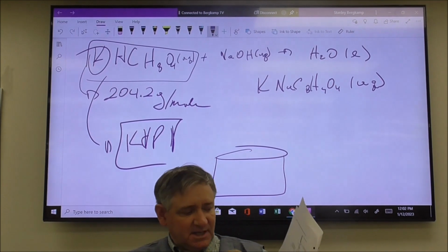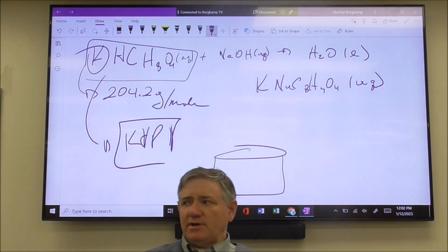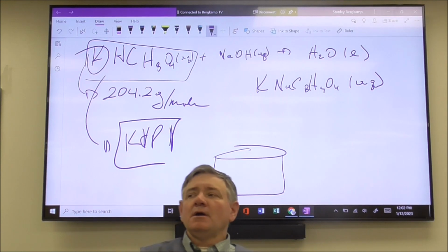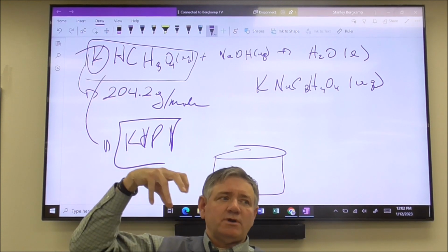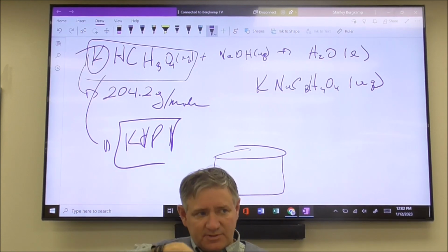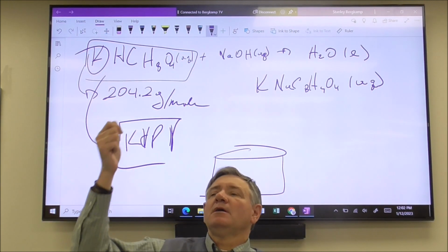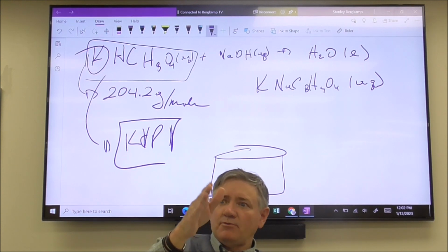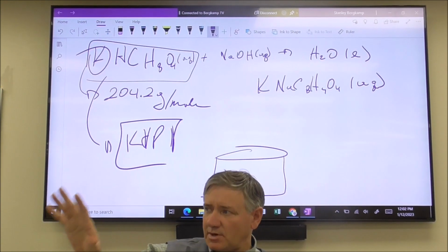We already did the first step. We boiled the water to get rid of the carbon dioxide, because carbon dioxide in water forms carbonic acid. If you're trying to find the molarity of a base, you want to make sure there's no carbonic acid in there that could interfere and react with the sodium hydroxide. That way, any reaction that occurs is only with the KHP and not with carbonic acid that could also be in the solution. So we did that to purge your water of carbonic acid.